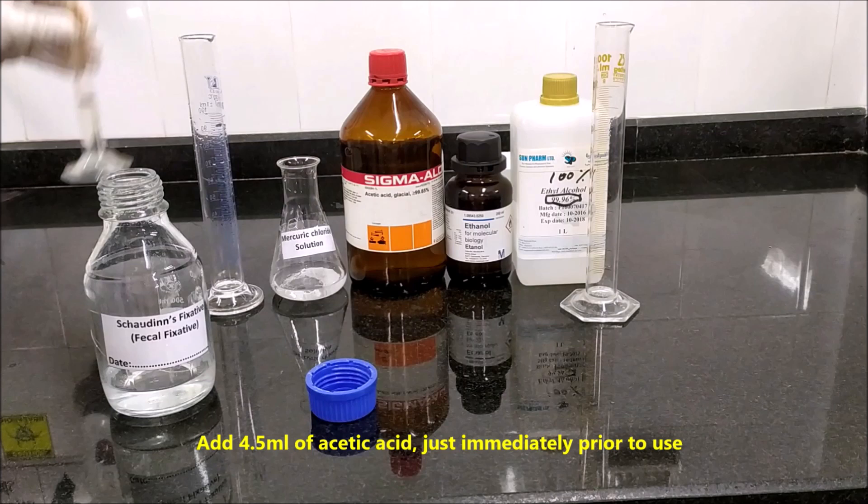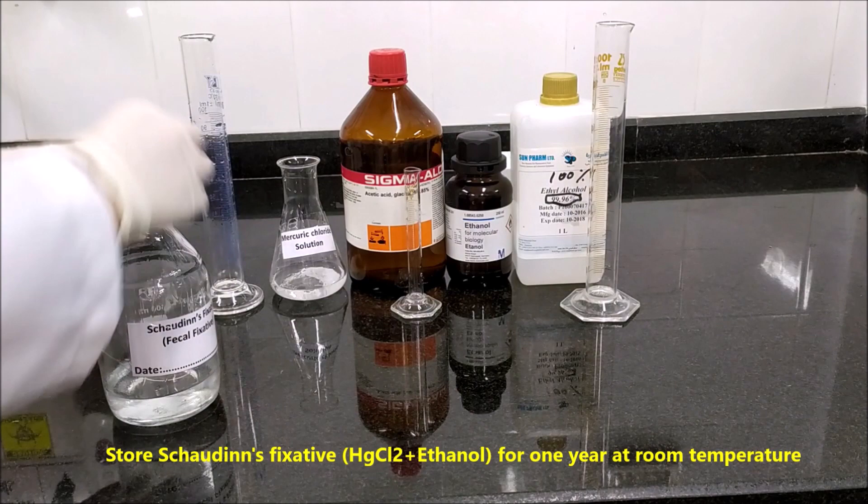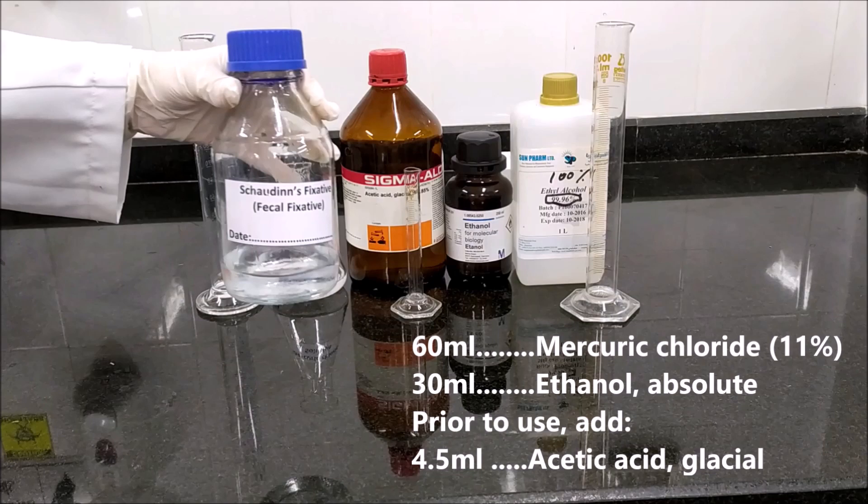Add 4.5 ml of glacial acetic acid, just immediately prior to use. Store Chauden's fixative — HgCl2 plus ethanol — for one year at room temperature.